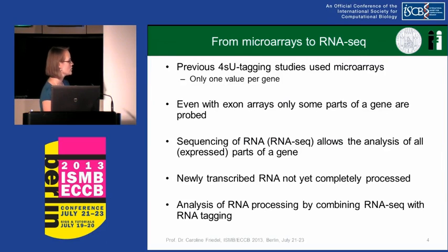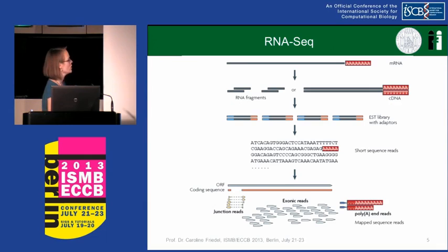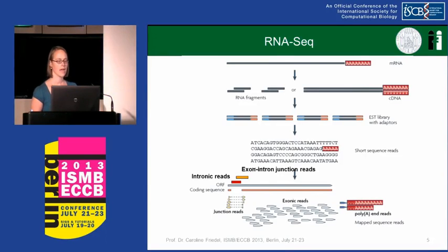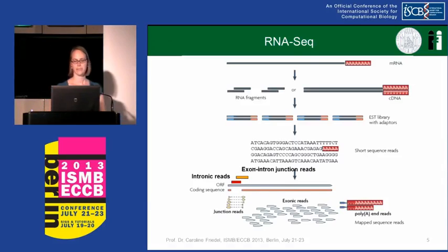So if you combine these two techniques, RNA tagging and RNA-seq, you can actually look at the processing of the RNAs. Usually, if you do RNA-seq, which is just an overview of the protocol that most of you should know, you get your sequence reads from the exonic parts and the exon-exon junctions. If you do 4sU-seq, you also get intronic reads of partially spliced or unspliced transcripts, and also exon-intron junction reads. You have to include this in your mapping process, but that's not really a problem.